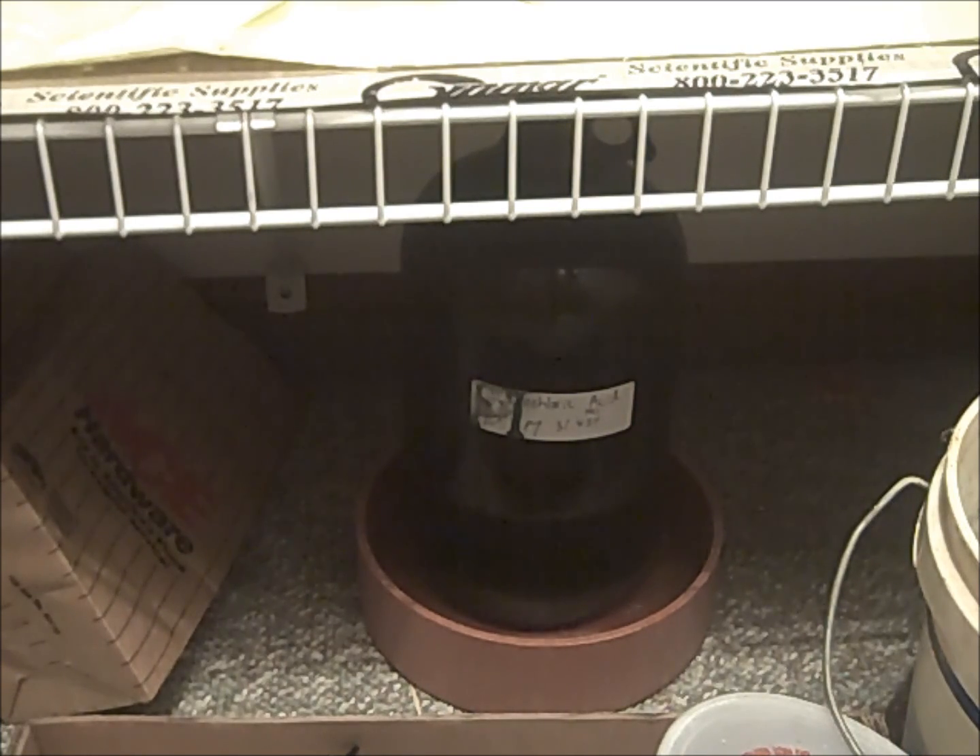We begin with hydrochloric acid. It is sold in 10.2 molar concentration under names such as muriatic acid. It sees use as a heavy duty toilet bowl cleaner, a concrete etchant, and a pH lowering chemical and chlorinating agent for swimming pools. It is sold very cheaply for about $5 a gallon. I have moved it from its plastic container into a PVC coated glass bottle for safer long-term storage. It is kept by itself because its fumes are highly corrosive to many materials in their containers.